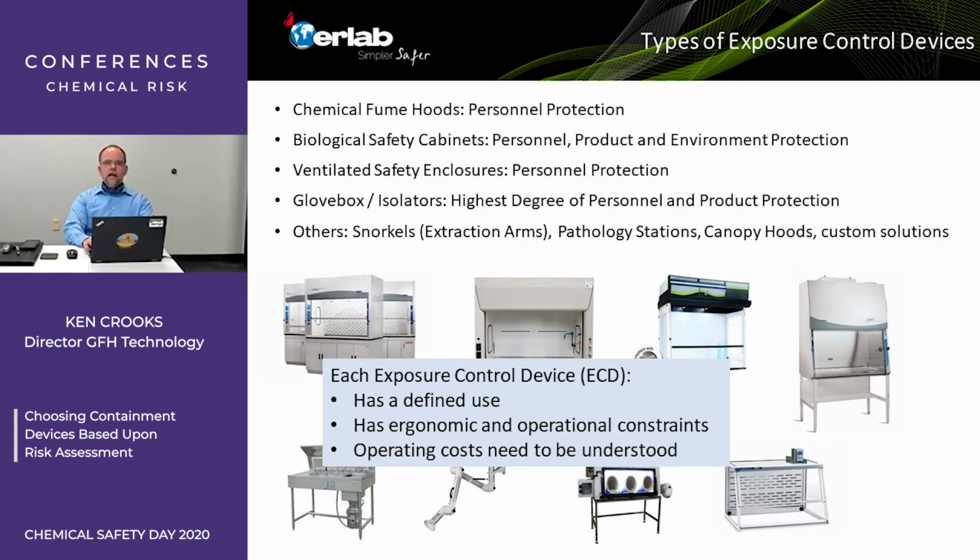Each ECD has a very defined use. The manufacturers can tell you about that. Obviously, there's industry experts, and you know also. So utilize all that information to make sure you're choosing the proper one for your hazard. It has ergonomic and operational constraints. Biosafety cabinets generally have a chair in front of them. You're seated. Fume hoods, you're generally standing. That may or may not work with the users. They may have their own needs to make sure that ergonomically they can properly use that.